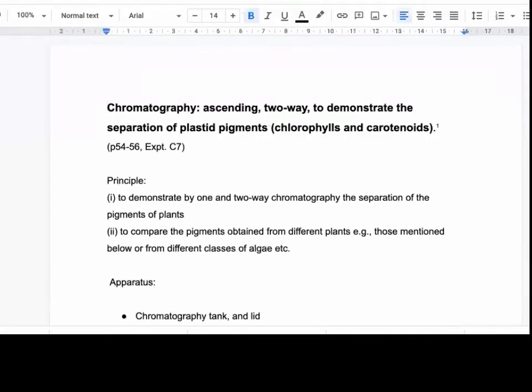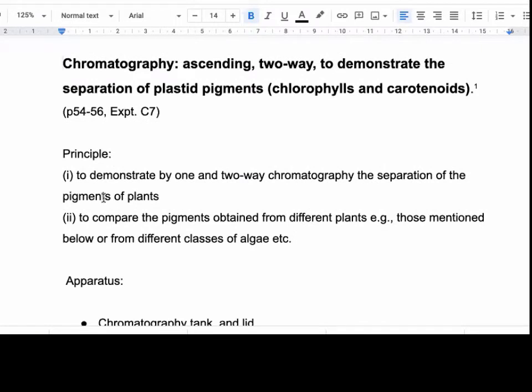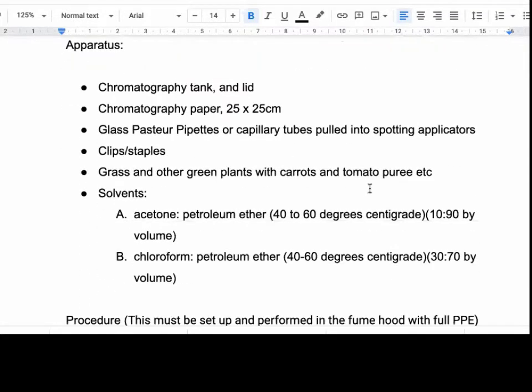So I think I've linked this in Loop. Okay, so it's chromatography, it's ascending. In other words, it's going up the paper. It's two-way because we're going to change directions midway, and we're going to separate plastid pigments. Plastids are chloroplasts and other objects inside the cells which contain pigments.